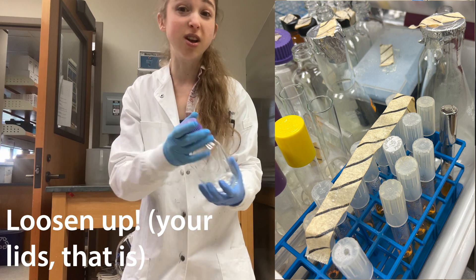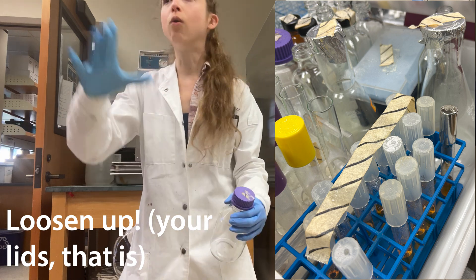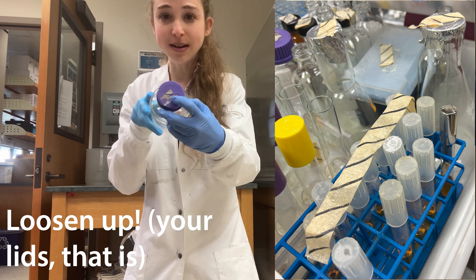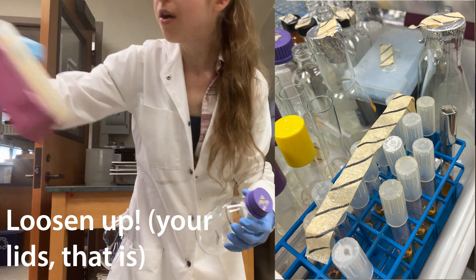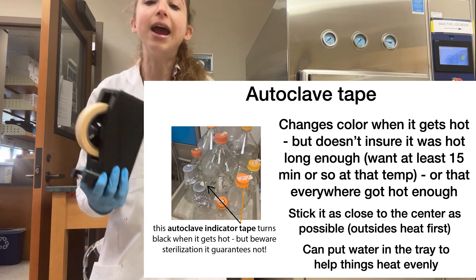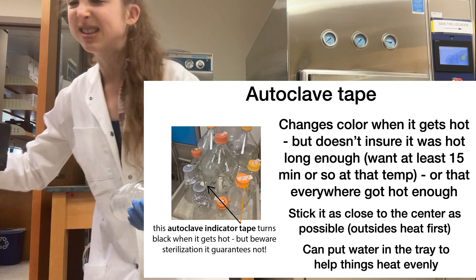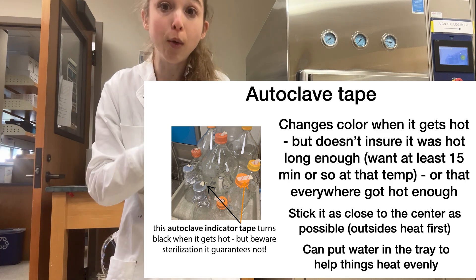Also, if you have containers — often Erlenmeyer flasks — we're going to stick a piece of foil over it, or there are special loose lids you can put on. Speaking of lids, you can see there's some stuff on here — this is autoclave tape. The autoclave tape is temperature-sensitive tape; it changes color in response to temperature. I know I say this all the time, but I really want there to be ones with jokes on them or something fun, but typically it's just lines or something boring, maybe even a brand name that shows up when it gets hot.